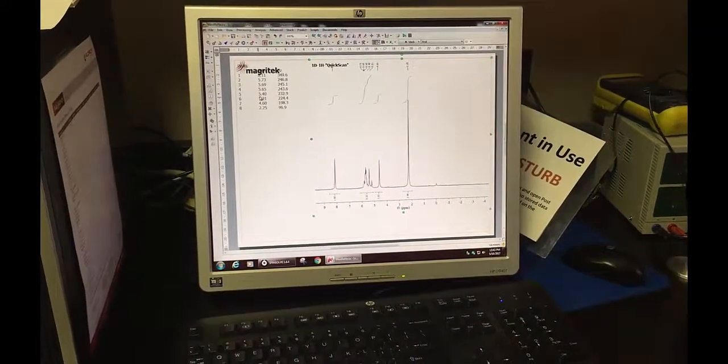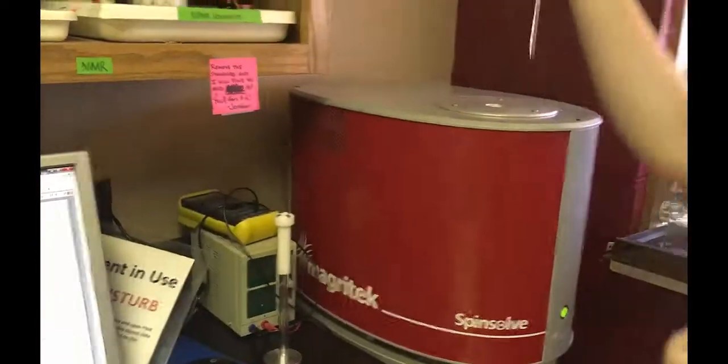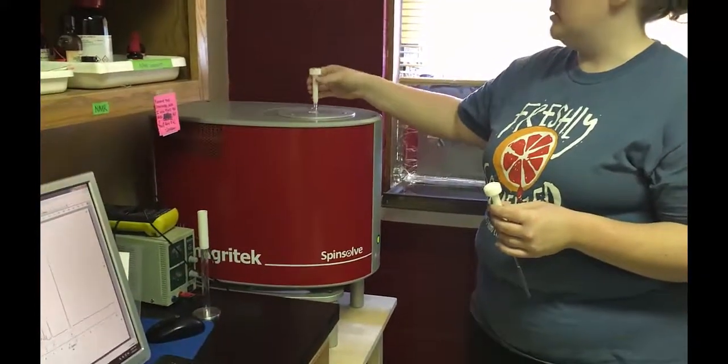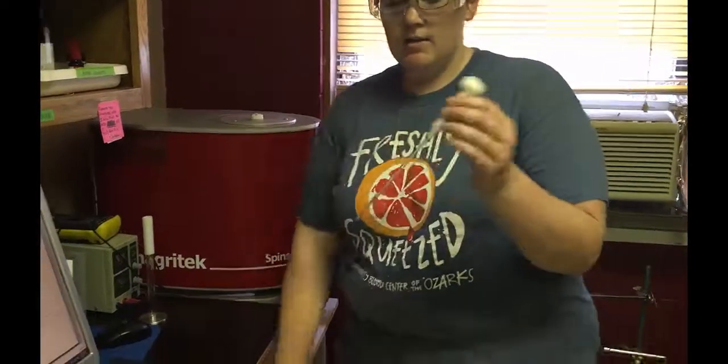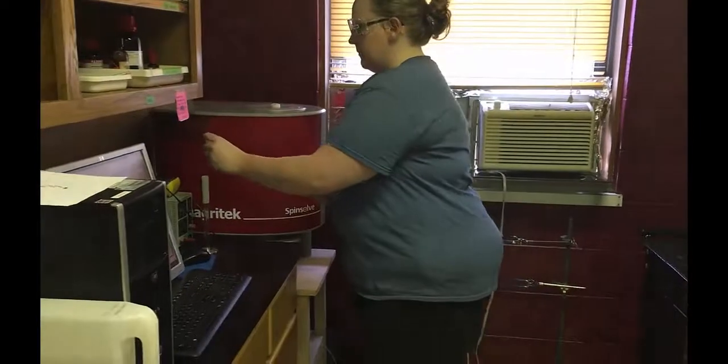Now after you've done your spectra, you're going to come back over, take your sample out of the machine, and put the standard back into it. Make sure you always do this, because it will keep the machine in good working order. Then to take your sample out, push down, and your sample comes right at the top.